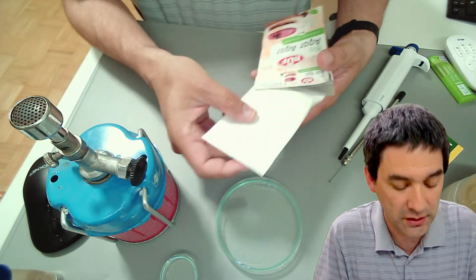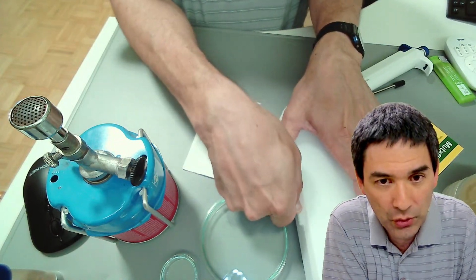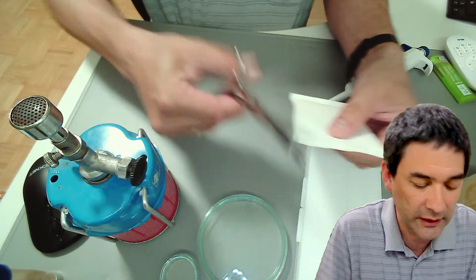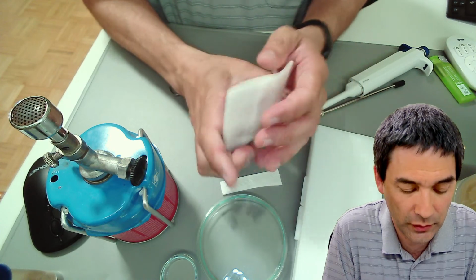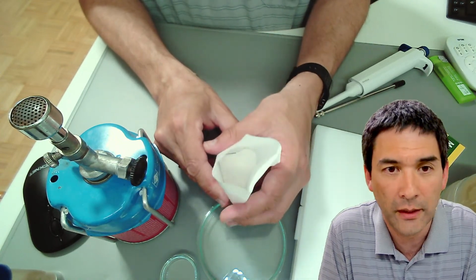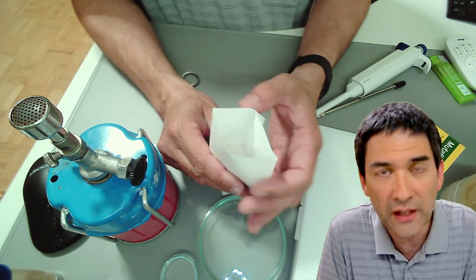Well, the agar is just a powder. I'm just going to open this. Look, this is actually a slide box that I'm now also using as a toolbox. I want to show you how the agar looks. It's just a regular powder. It's really nothing spectacular. You're able to see it here, right? Just some white powder. It looks a little bit like flour, and you have to mix it with water, and then you heat it up, and when it cools down, it starts to turn solid.